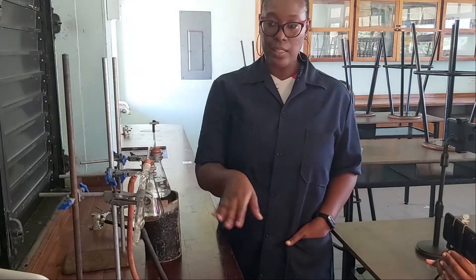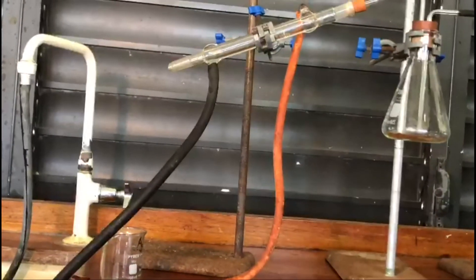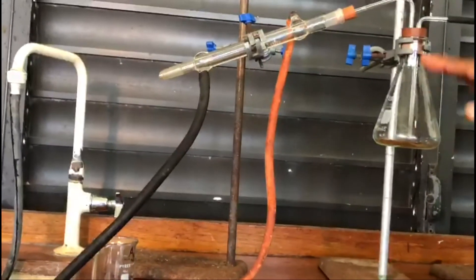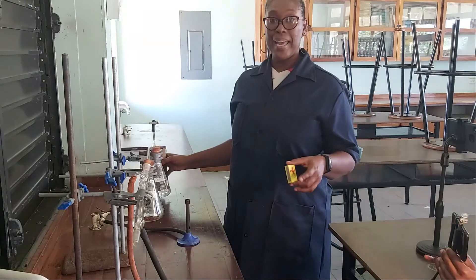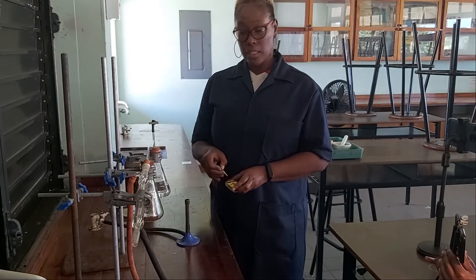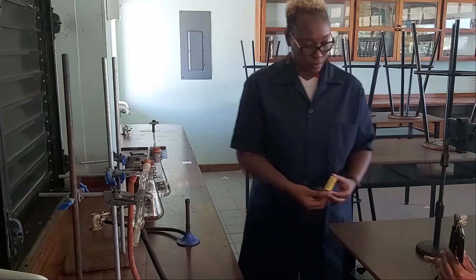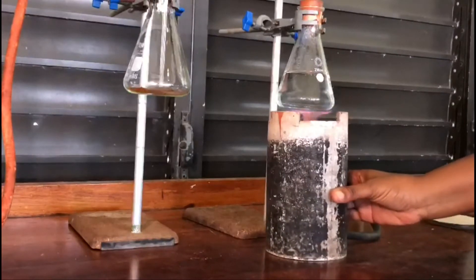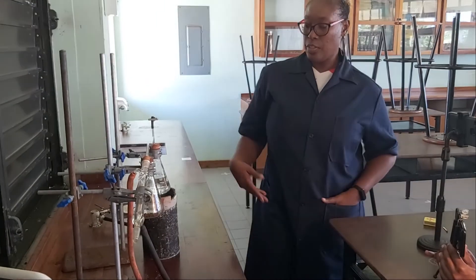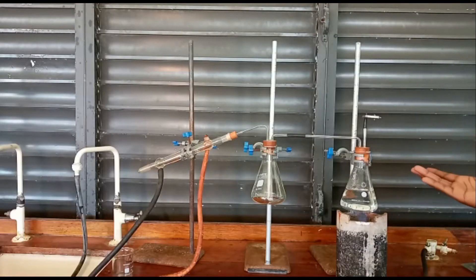You can see the bubbles as the water makes its way up. Remember that the condenser is positioned on a diagonal so that the distillate leaves by gravity. I'm now going to start the distillation by turning on the Bunsen burner to heat the water. As the water boils, we would expect steam, which is a colorless vapor and therefore not visible, to make its way through.